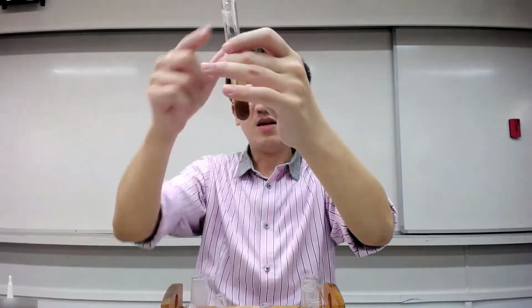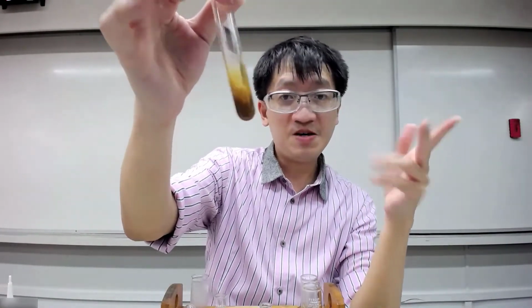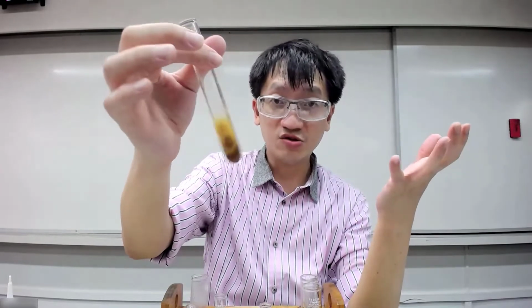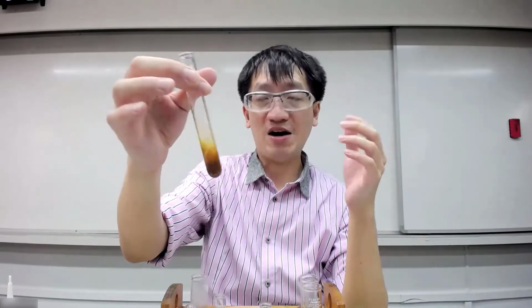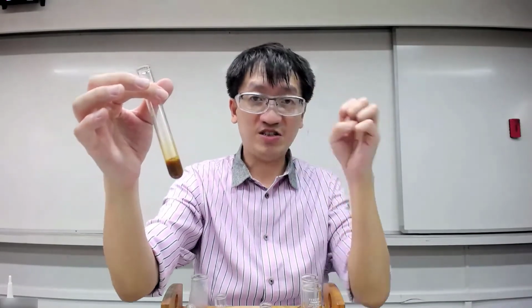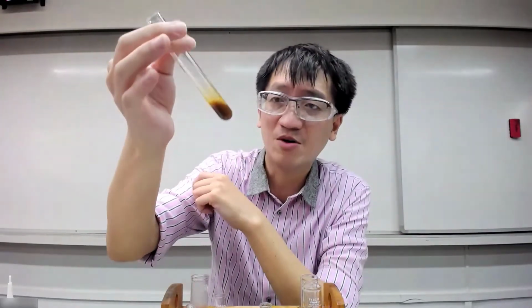So I am just going to follow the instruction and add. Now, most of the students, they will just add, and then this is what they observe. Then they will write brown PPT. But the PPT is actually not brown. The PPT is actually white. And the brown is actually the solution due to the production of iodine. How do I know it's iodine? Well, later on, the next step is to add thiosulfate. When you add thiosulfate, a lot of students wrote the wrong conclusion, like the brown PPT decolorized to give you white PPT. This is not possible. Well, it could happen to some compounds.